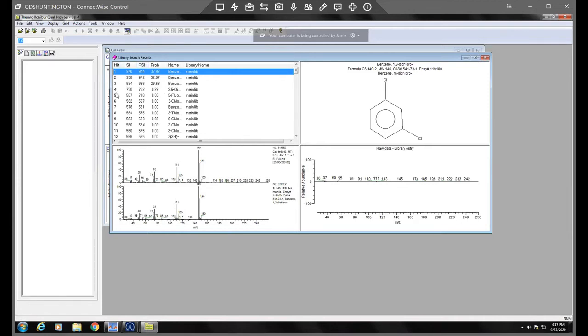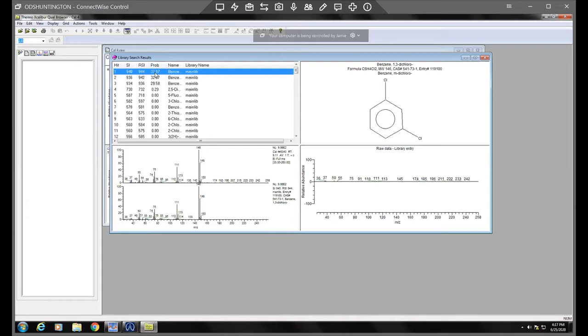And the way you would use this top part is you would actually, most people like to look at this probability, but I was actually told by Thermo that that's not the best indicator of what's accurate.